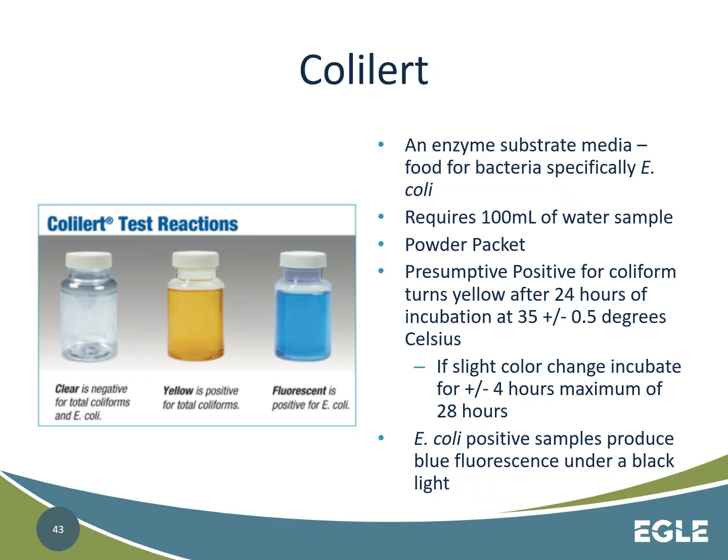All right. So you get a 100 milliliter sample of water, and then it is brought in a cooler to your certified lab. In order to run any of these bacteriological methods and be accepted by the state, they have to be run in a laboratory certified by the state of Michigan. There's a list of those on our website. So what you're going to do is take a 100 milliliter sample.